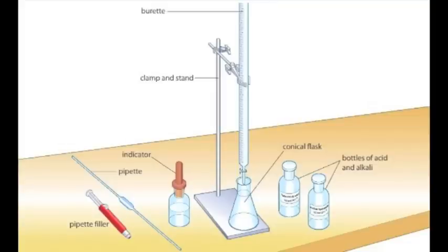Many different acids and alkalis are used in everyday life. These solutions are often analyzed using titrations. In these titrations, a pipette is used to accurately measure a set volume of the alkali into a conical flask. Pipettes come in several sizes varying from 1 cm³ to 50 cm³. Accuracy of plus or minus 0.05 cm³ is common.